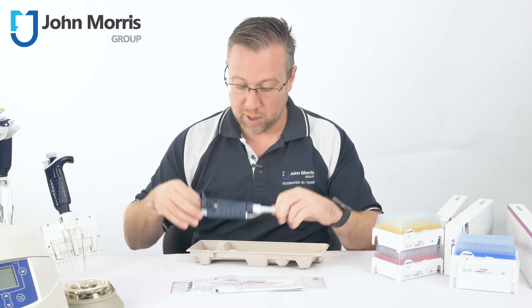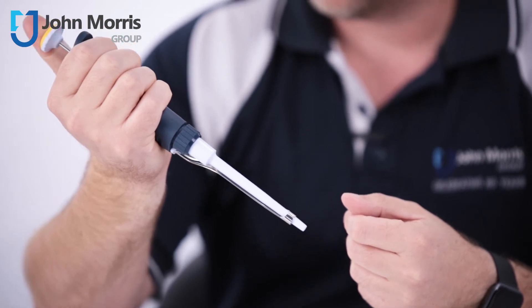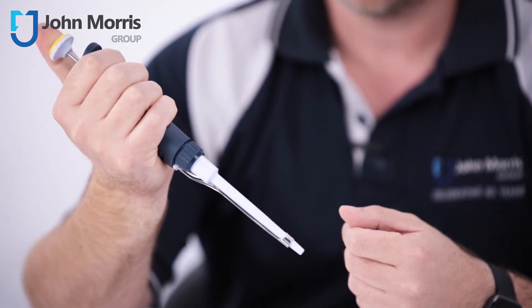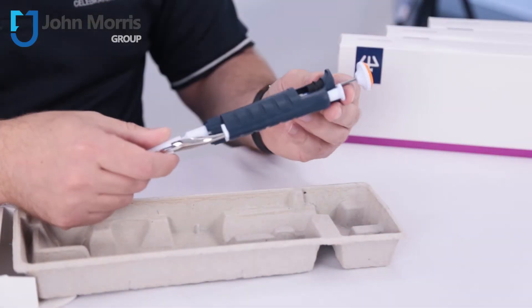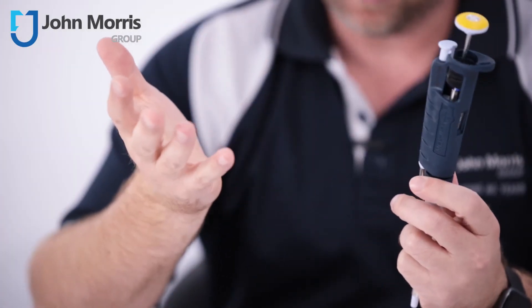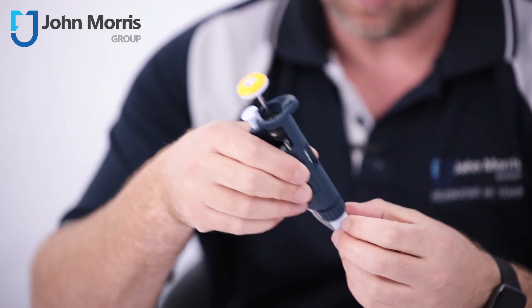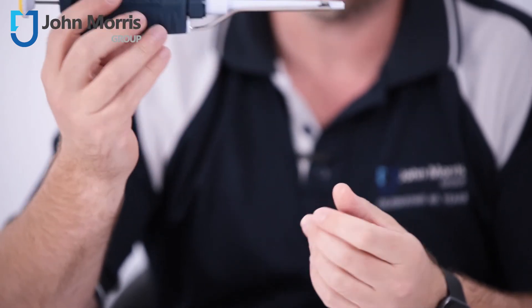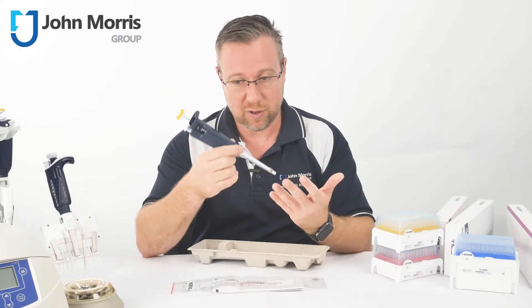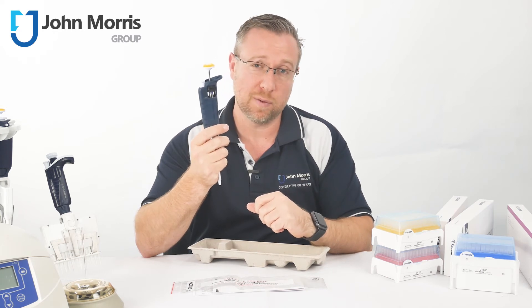And you get your pipette. The G's are a greased pipette, and that's why they have this amazingly low force — very ergonomic, very easy to push down. They're a beautiful pipette, very rugged and robust with a PVDF handle, which is very good for making sure that you don't transfer heat from your hand into the air volume inside the pipette. That's one of the reasons they provide such an accurate, precise, and repeatable pipetting experience.